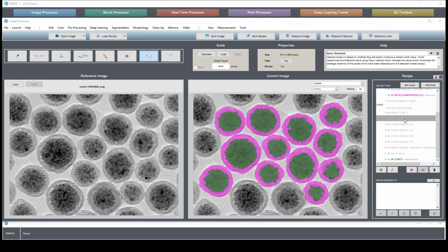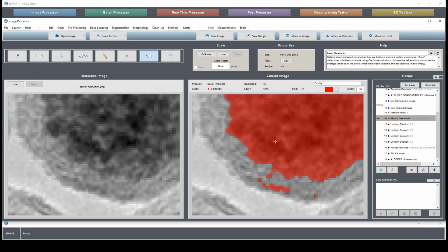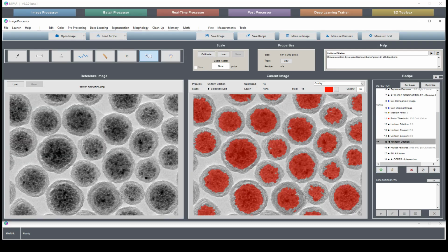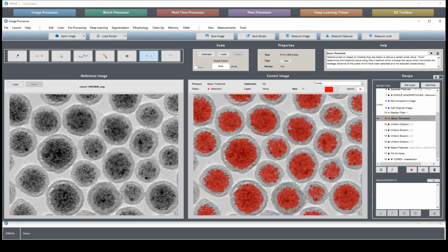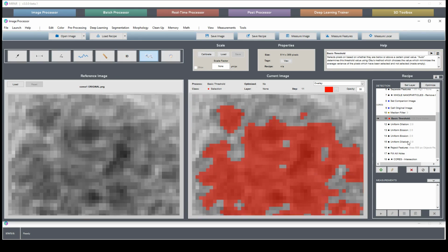Now, let's say that you didn't like the fact that our opening and closing tended to mess with the outsides a little bit. Shifted this over some, and the border got a little bit messed up because of this interaction with the piece on the outside. And you didn't like how careful we had to be to choose this depth to not join these together while joining this together.